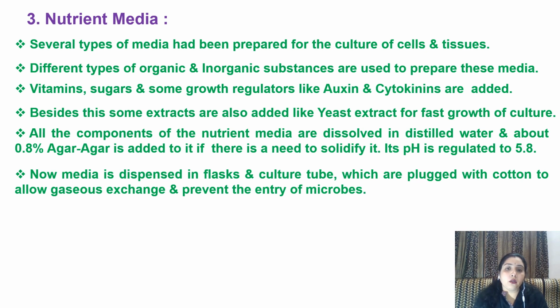All the components of the nutrient media are dissolved in distilled water, and agar-agar is added if there is a need to solidify the media. The pH is maintained at 5.8. Now the media is dispensed in flasks and culture tubes, which are plugged with cotton, which allows the gaseous exchange and prevents the entry of microbes.